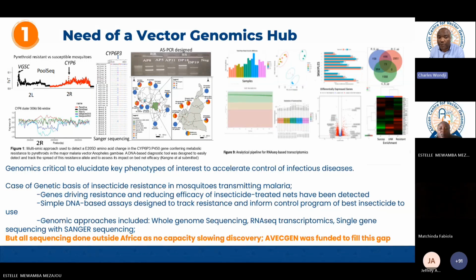But when you detect the regions where the genes might be located, it's only a first step. You still need to put your finger on the specific gene. And often to do that, you need to use Sanger sequencing. So you can see that the sequencing platforms are complementary. Next generation sequencing and Sanger sequencing work together to allow you to get the final answer. When we detected the region, we also had a list of potential candidate genes, which we moved to Sanger sequencing to sequence a few more samples.